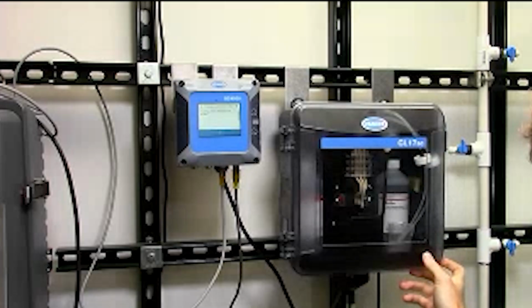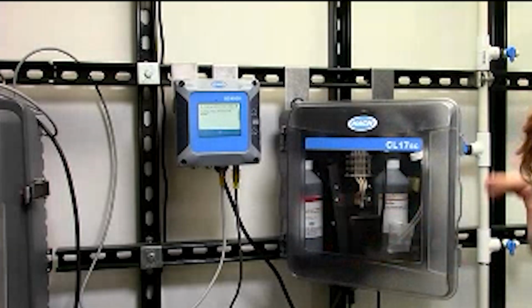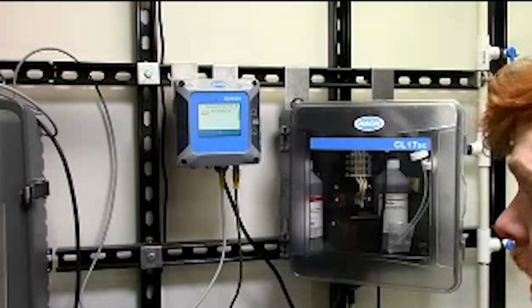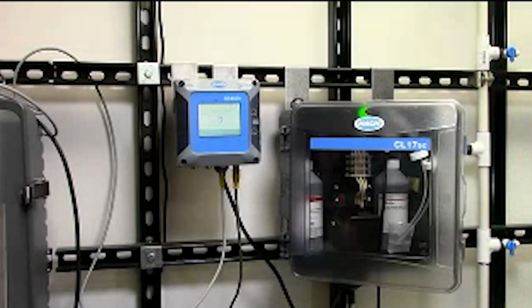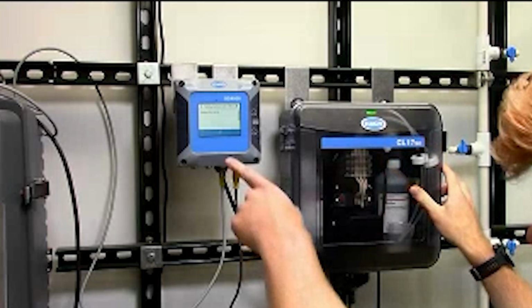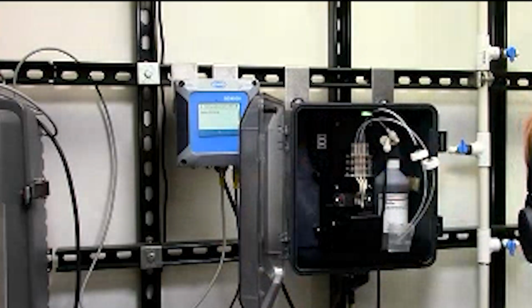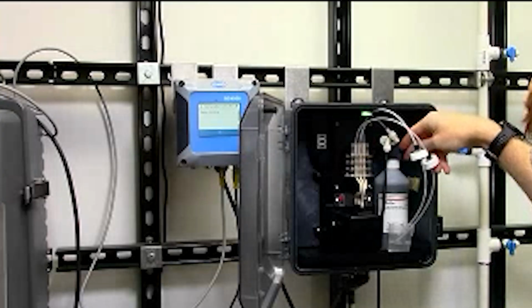And I'm going to, at this point, wait for my instrument to tell me when it's time to go ahead and do a tubing change. So I'm cheating a little bit. My reagents aren't connected just because we're not typically running a real sample here. But as soon as I get a prompt and as soon as I get this green flashing light, I'm going to be told to replace my tubing. And first of all, I'm going to remove my reagents here.